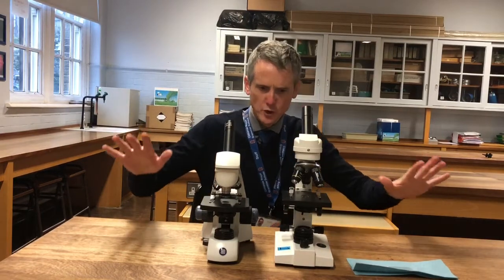Hello folks. Welcome to my Microscope Lounge. I'm just going to go through basically how to use a microscope.